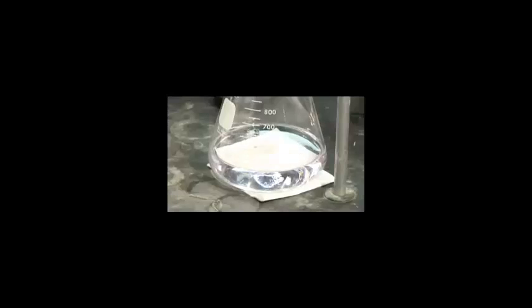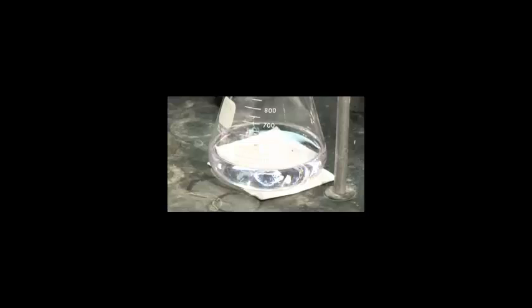And the rest of your lab is to titrate your iron ore, and you're going to follow exactly the same procedure as you did for this, except with your second sample. And don't forget to record your initial point and your end point.